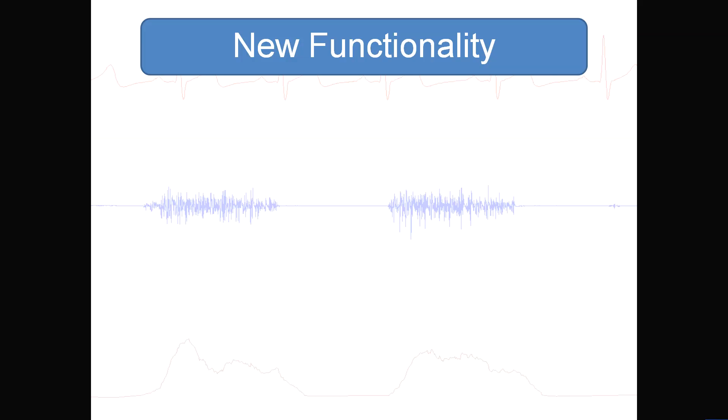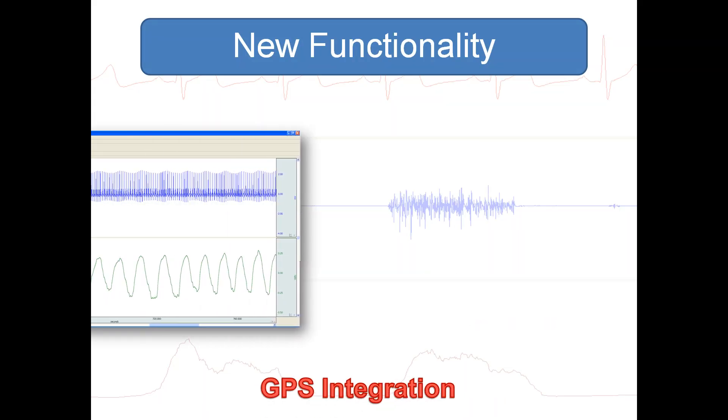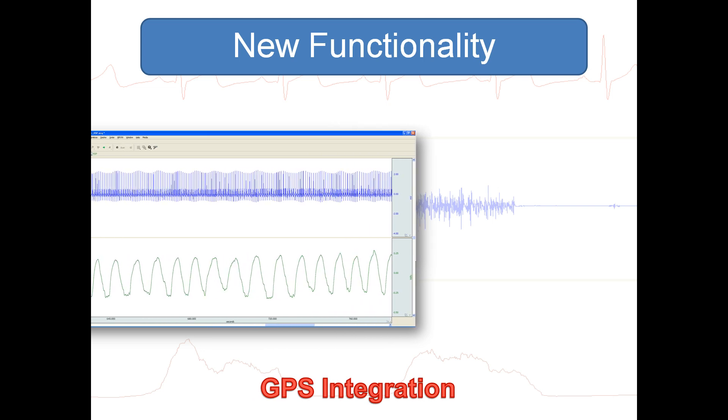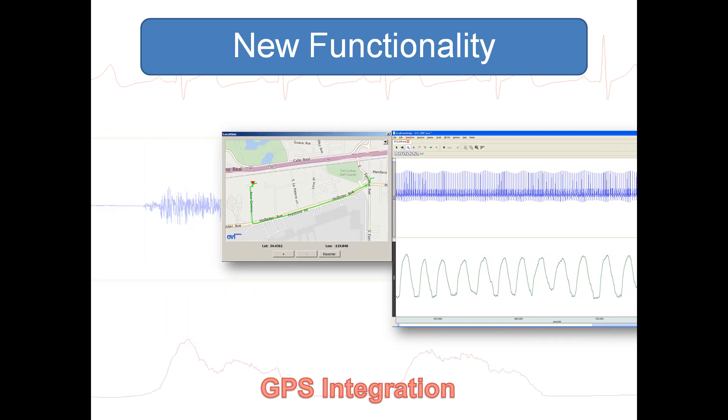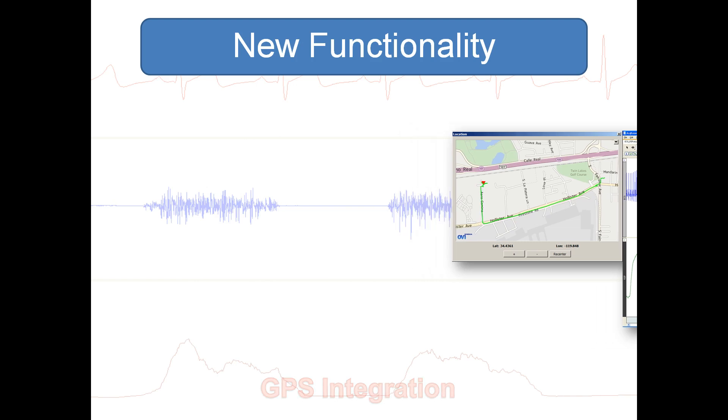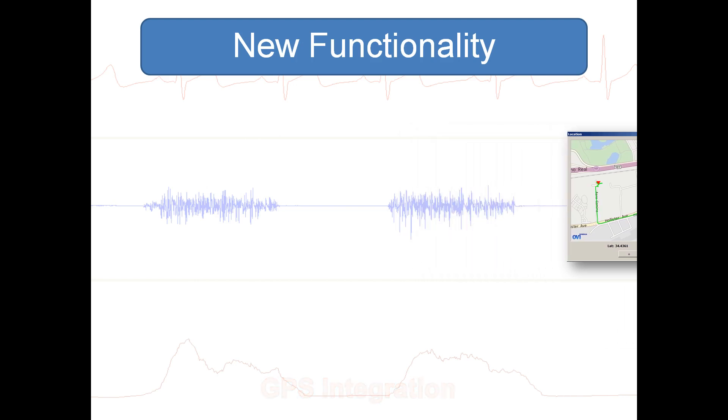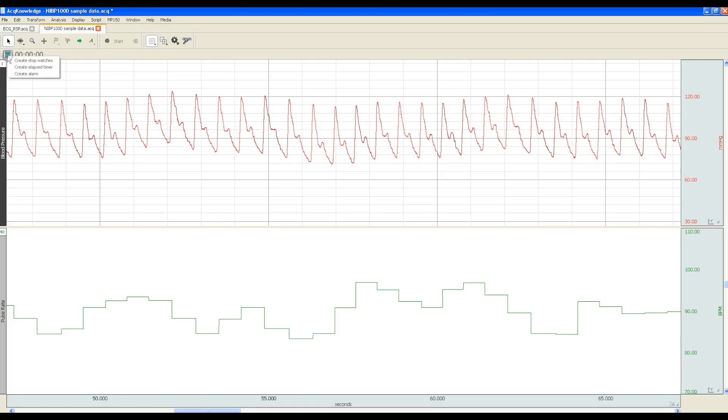Other exciting new functionality includes GPS integration to correlate subjects' physiological responses with their location data. Timers allow you to create stopwatches, elapsed timers, or alarms to track timing information in AcqKnowledge.